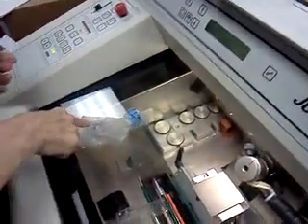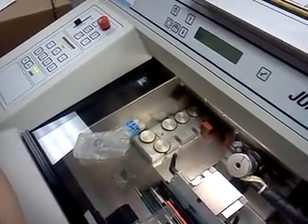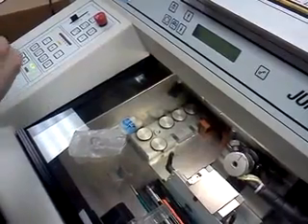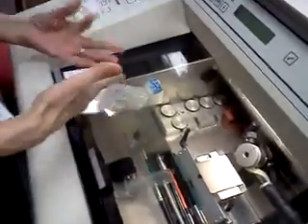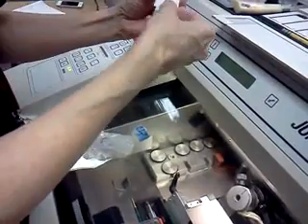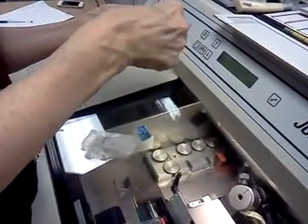Somewhere in a book, somewhere in the lab, I know that I've cut this before. I need to go get that notebook, and then this won't be 1 and 2, because it will be however far we cut. If it was important tissue, we would start from that number and end. Since I'm not interested in this anymore, I save these for practice. I'm not going to be rigorous about how I identify today. Okay. We're just going to use it for practice. So, these are all practice. And we're just going to set them up.